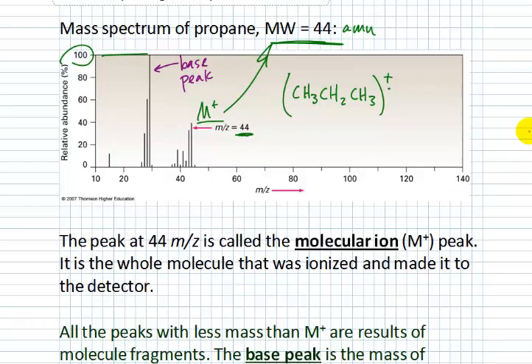And if you look closely at this mass spectrum we have here, the molecular ion is this one right here, but you see a tiny little peak next to it, 1 unit greater in mass, that we call M plus 1. And since this is just a hydrocarbon, what that M plus 1 refers to is 1 carbon 13 that has been represented within this molecule. And as you did in your lab activity, you saw that the more carbons you have in your molecule, the more chance you have to get 1 carbon 13 incorporated somewhere.